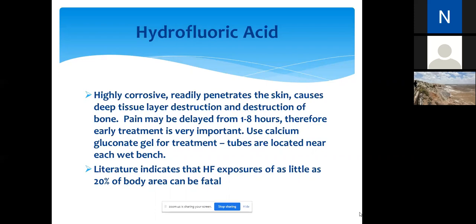In this area, the Norfolk area, I know for certain from experience that if you call 911 and tell them you have had a spill, but you can't tell them what it is that spilled on you, they will come and check on you, the fire department, ambulance, and all that. But until they have an SDS for the chemical that you are working with, they are not transporting you anywhere.